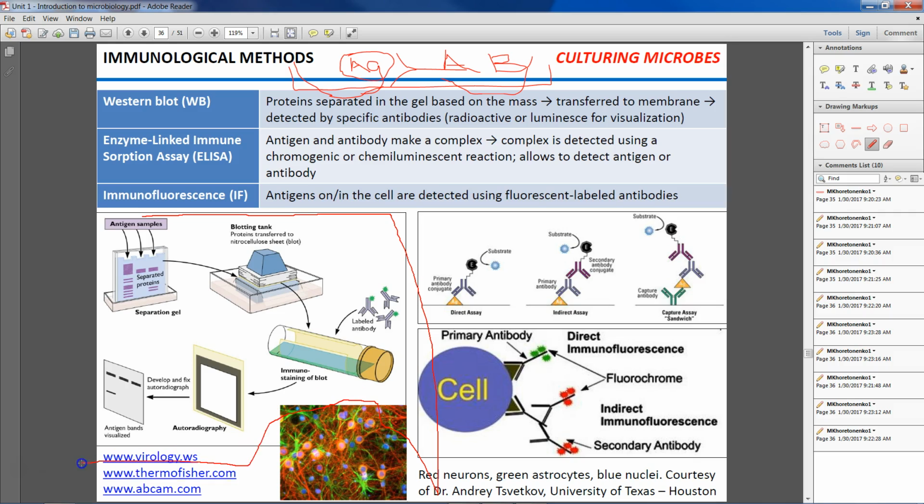Without this picture, okay, so this is Western blot. What does it do? It detects proteins in a mixture. So first, you gotta have your sample, say you have a colony, bacterial colony, a bunch of cells. So what you do, you take those cells and you almost literally explode them. You lyse them. You break them in pieces. Does that make sense? Those pieces are going to be proteins. There are going to be thousands of them.